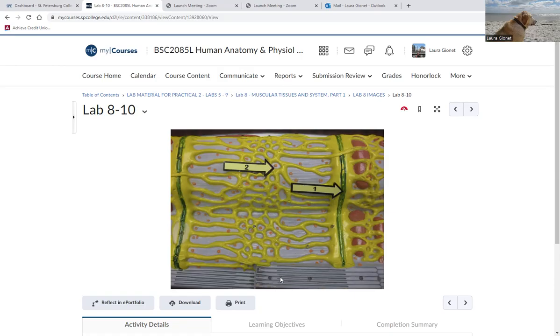The other thing I like about it, down below, are the thicker and thin gray lines. I think these are a little easier to see because they're spread out a bit. Right here over to the left-hand side, you can see the thinner dark gray, not the light gray. The light gray is the cytoplasm within the cell. But the darker little lines are the actin filaments or the myosin filaments. Thin dark gray lines are actin. Thicker dark gray lines, toward the center, are myosin.